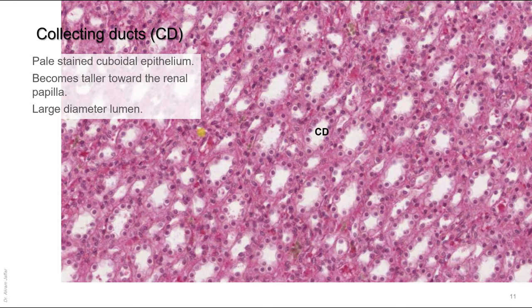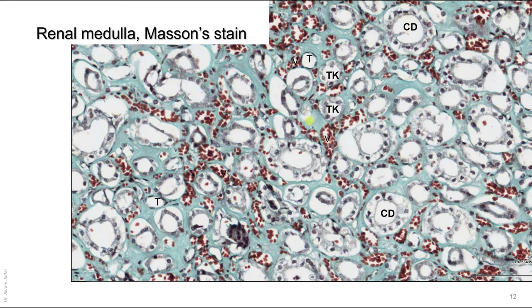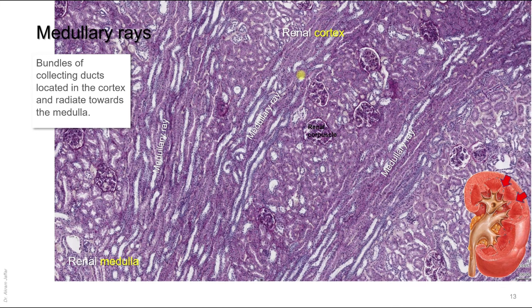Collecting ducts are mainly found in the medulla, lined by simple cuboidal epithelial cells with no brush border. Their cells are slightly taller than those lining the thick limb of the loop of Henle and their luminal diameter is larger. In a section stained with Masson's stain — which highlights connective tissue — you can still identify thick limbs of the loop of Henle, collecting ducts with large lumina and taller cuboidal cells, thin limbs of the loop of Henle, and vasa recta.